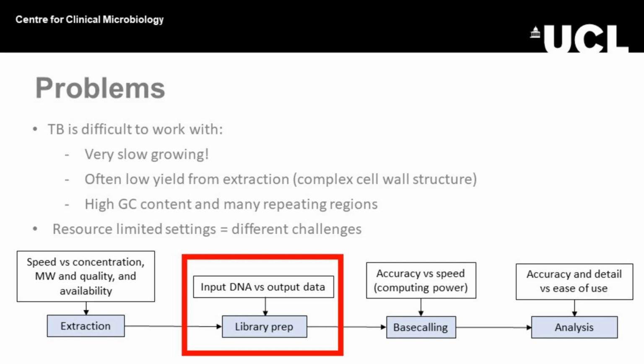I think that might be better explained if I show you this here. You've got the DNA here, it gets separated, and as it goes through the blue pore across the membrane, it changes the current. And so you get this squiggle plot. And then the computer will change that into the A's, T's, G's, and C's, and that's called base calling, which is something that Illumina doesn't have to do, but this is a completely different way of sequencing.